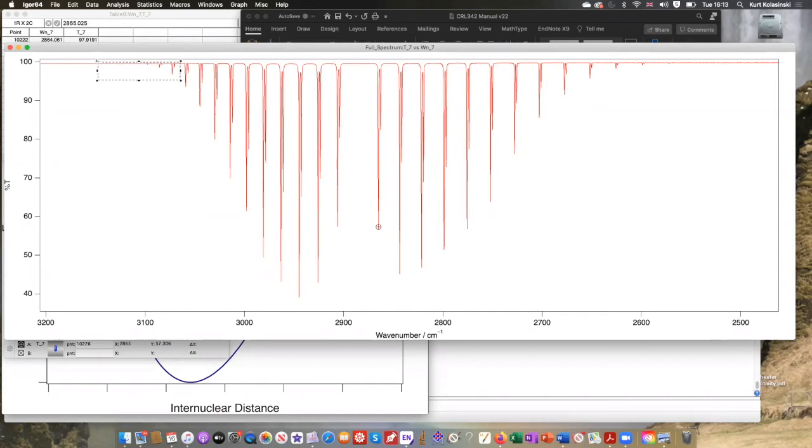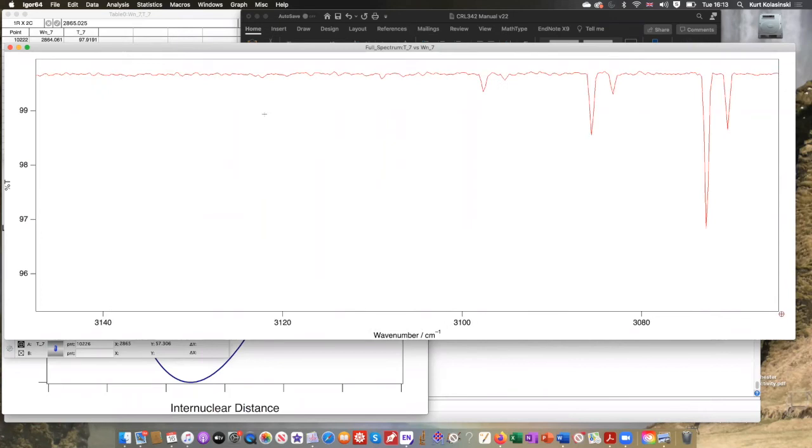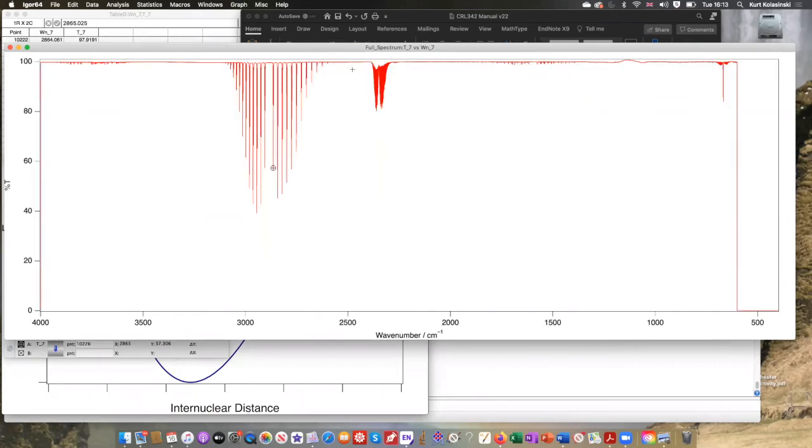Even if we can get some little peaks out here, because the more peaks we get, the better it is. So we're going to take the big peak, the big peak, the big peak. Maybe, right? Kind of hard to tell. This one, definitely, there's a little one, there's the big one, then we're just kind of running out of space. What about the other side, right?